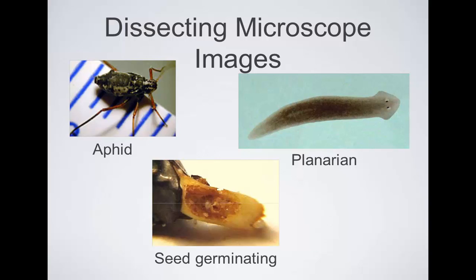So my whole digression is to tell you this has two eyepieces, allowing both our eyes to see the image at a different angle, giving us a good three-dimensional view. The electron microscope gives us great magnification. We can see things close up. Usually the images are gray. You can't really look at living cells or living organisms with an electron microscope because the objects need to be coated in metal so that the electrons bounce off to form the image. So usually the things are not alive and they have to be coated in metal.